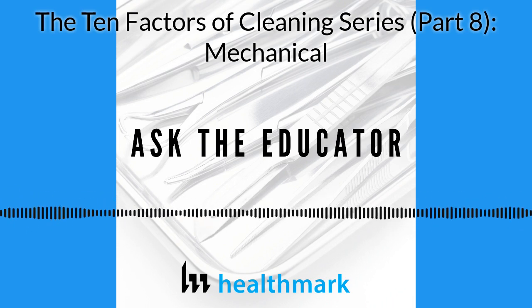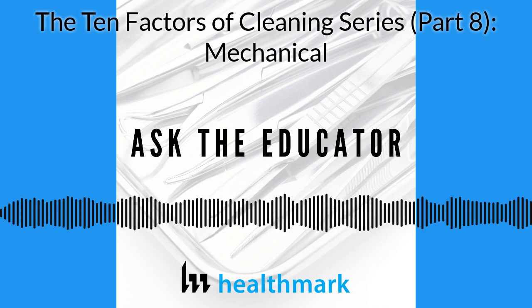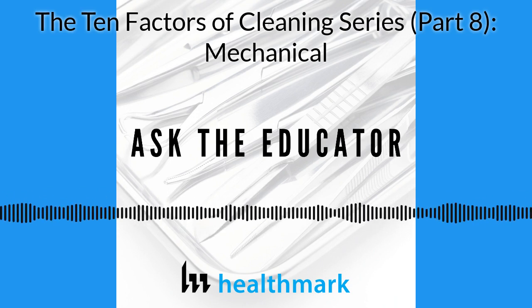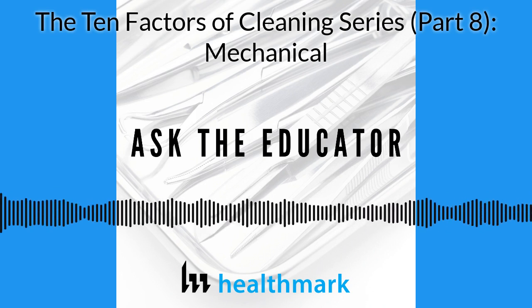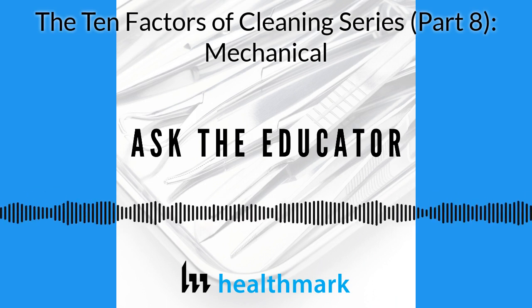And that's why we made that checklist that some people still don't use to this day. Are all the spinner arms there? Are they spinning properly? Are they plugged? And so on. That is part of your quality management system. So part of what you should do every day is check: are they all there? Are they working? The metal cage can bend over time.